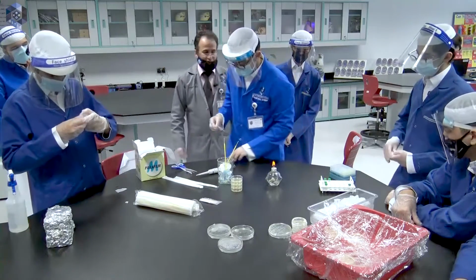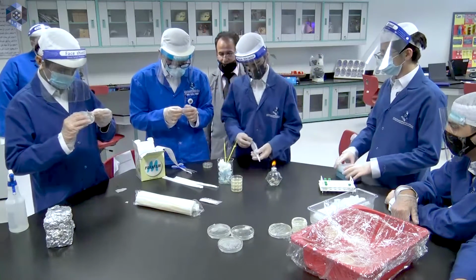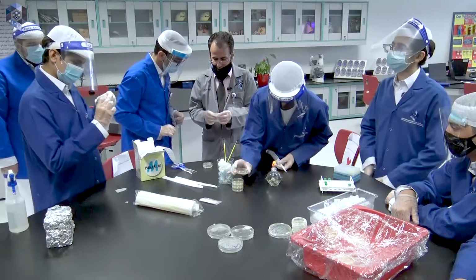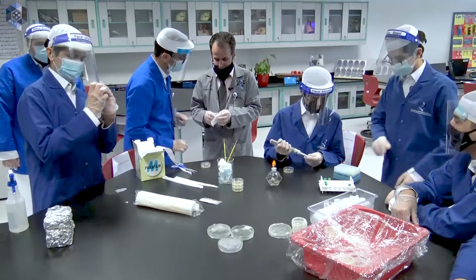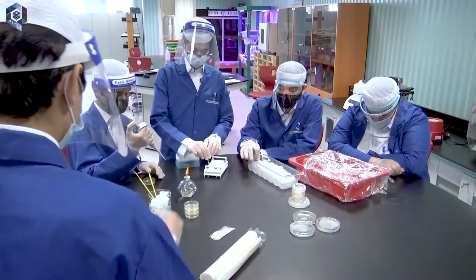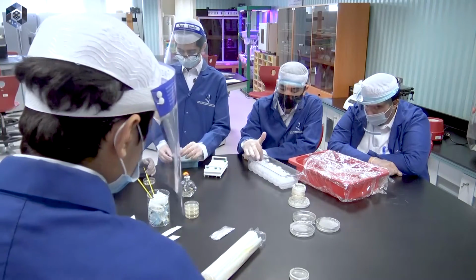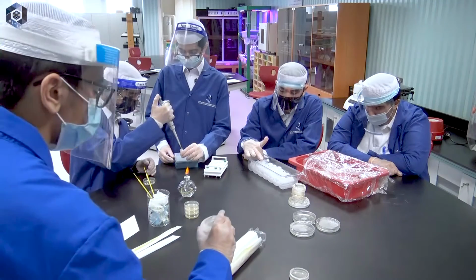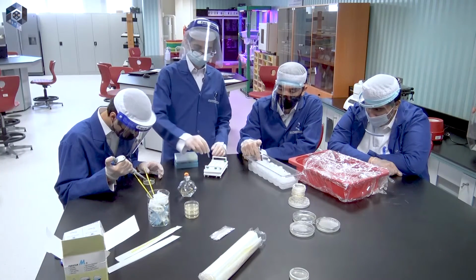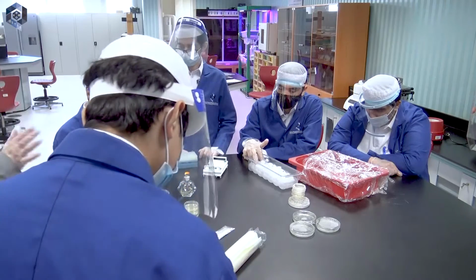Next one. Move aside. Go ahead. Leave it here for now. We will put all of them in the incubator. Bring the marker and label it with your name, with your initials. Leave it here. Don't move it. No problem, eventually we will use all of them.